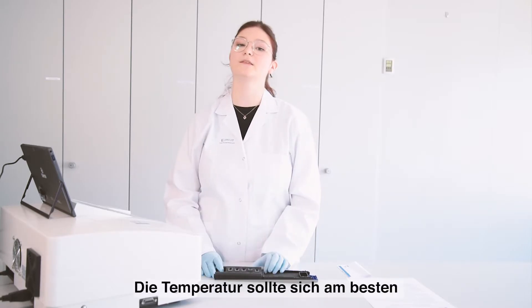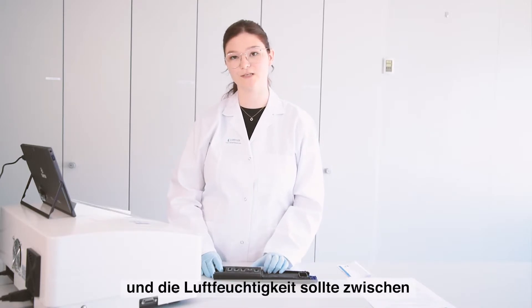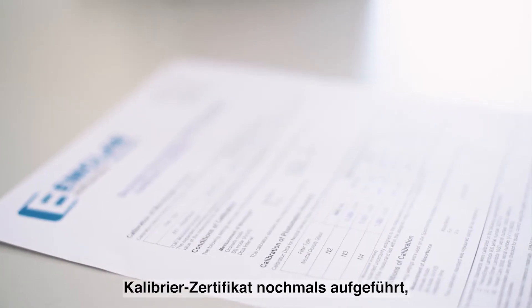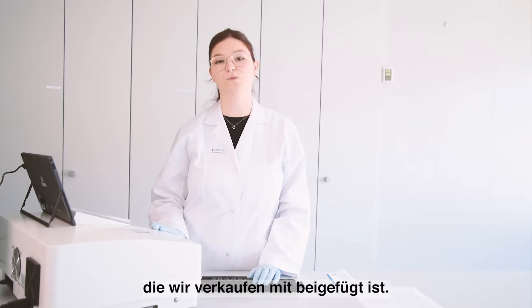The temperature is most optimal between 20 degrees Celsius and 24 degrees Celsius, and the humidity should be between 30 percent and 65 percent. These values are also stated on the calibration certificate which comes with each instrument we sell.